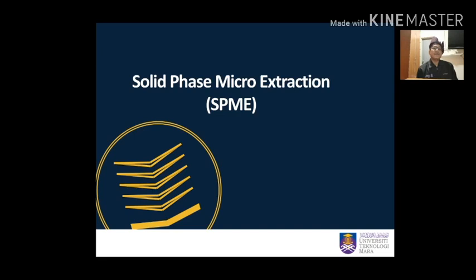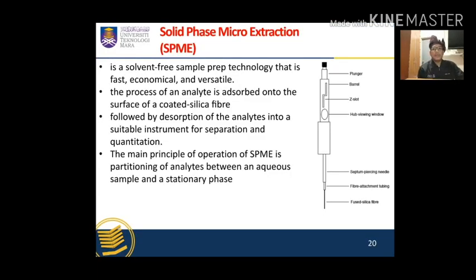So another sample preparation method for liquid samples for organic analysis is solid phase microextraction, known as SPME. Solid phase microextraction, SPME, is a solvent-free sample preparation technology that is fast, economical, and versatile. SPME is the process whereby an analyte is adsorbed onto the surface of a coated silica fiber as a method of concentration. This is followed by desorption of the analyte into a suitable instrument, for example GC, for separation and quantitation. The partitioning of analyte between the aqueous sample and a stationary phase is the main principle of operation of SPME.